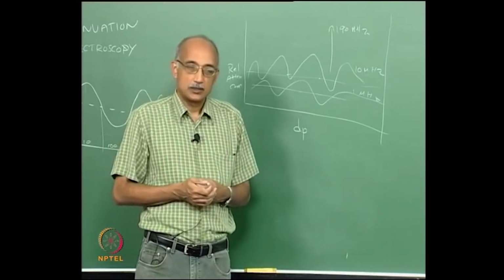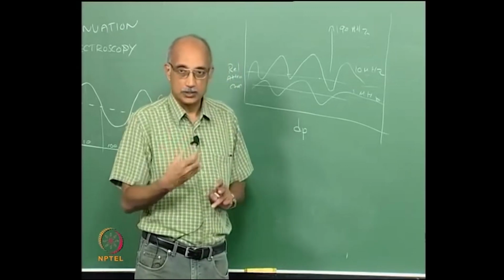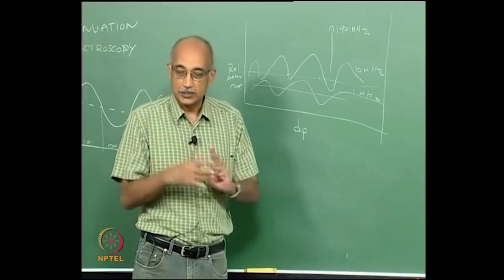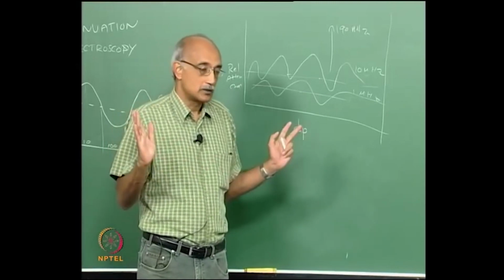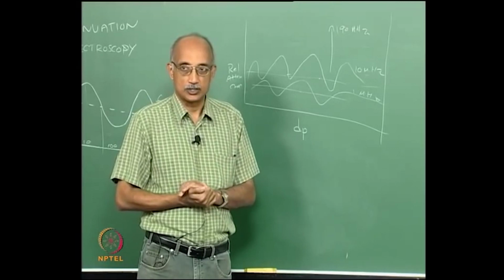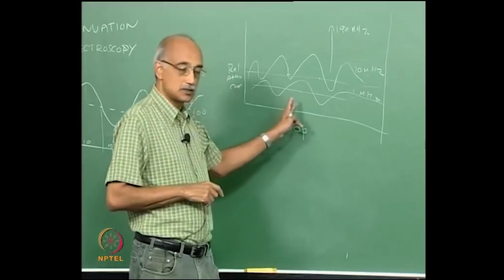The software already does the theoretical prediction, and then the instrument will do the actual size measurement by transmitting an acoustic field. It will then do the comparison, it will do the iteration. The whole thing will take about 10 minutes, and you will get a particle size distribution using an acoustic attenuation spectrum device. Again, the power of this technique is a very wide range, because this is very useful to us, right?